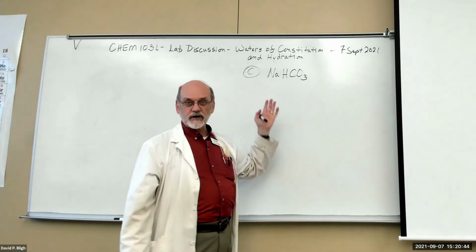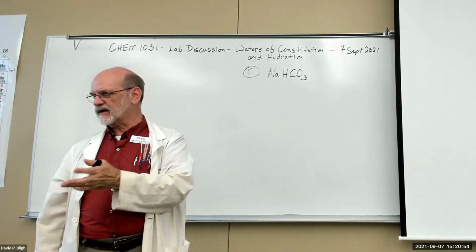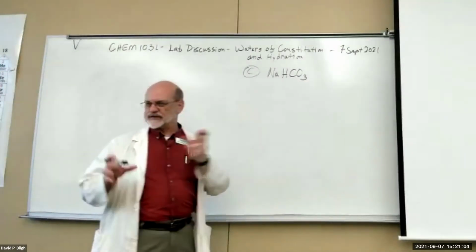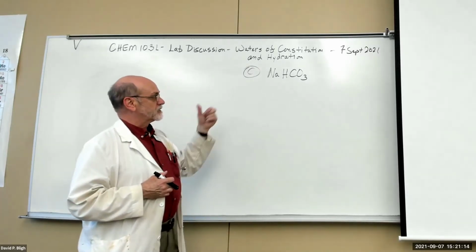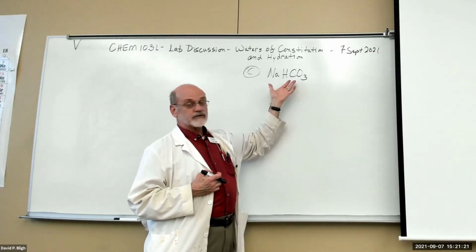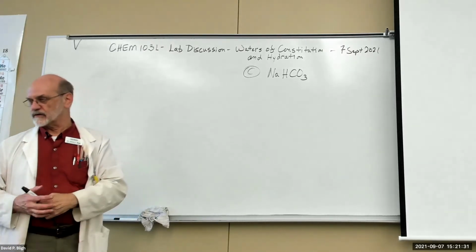With this one, it's a little different. You have to look more for texture, or just follow the instructions and heat it for as long as they say, and then maybe add a couple or three minutes to be sure that the conversion is complete. So if there's no water here, we can't use that same reasoning that I just gave you for the copper sulfate hydrate. It doesn't work because we don't just get rid of water here. There's also the possibility of getting rid of some other oxygen and maybe even carbon. We don't know. So we have to propose possible reactions.